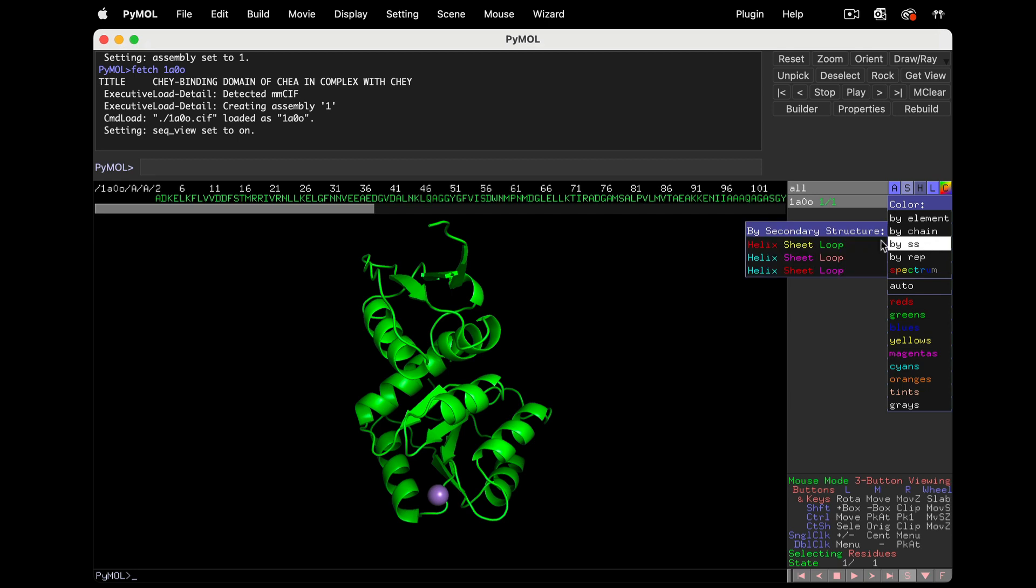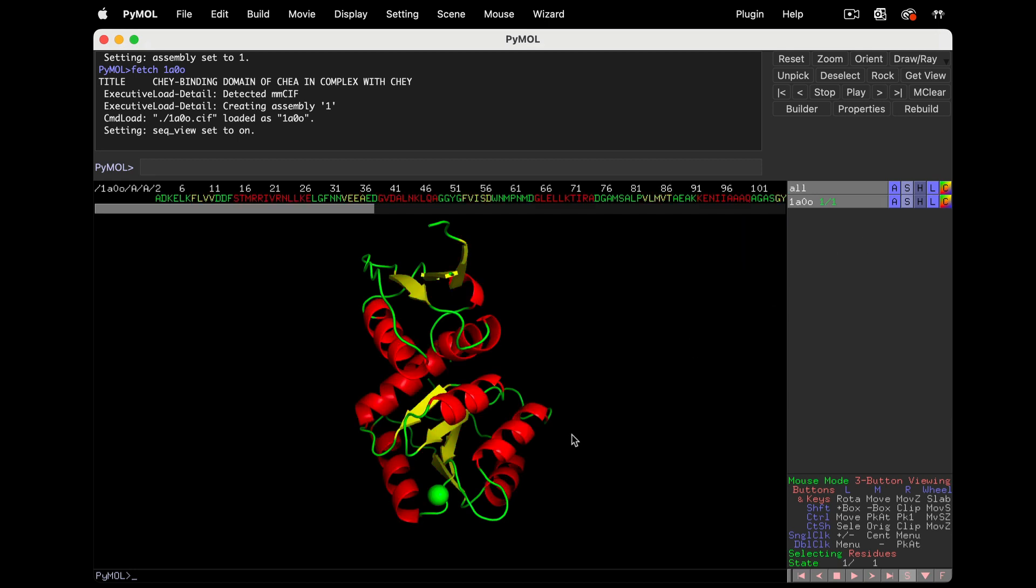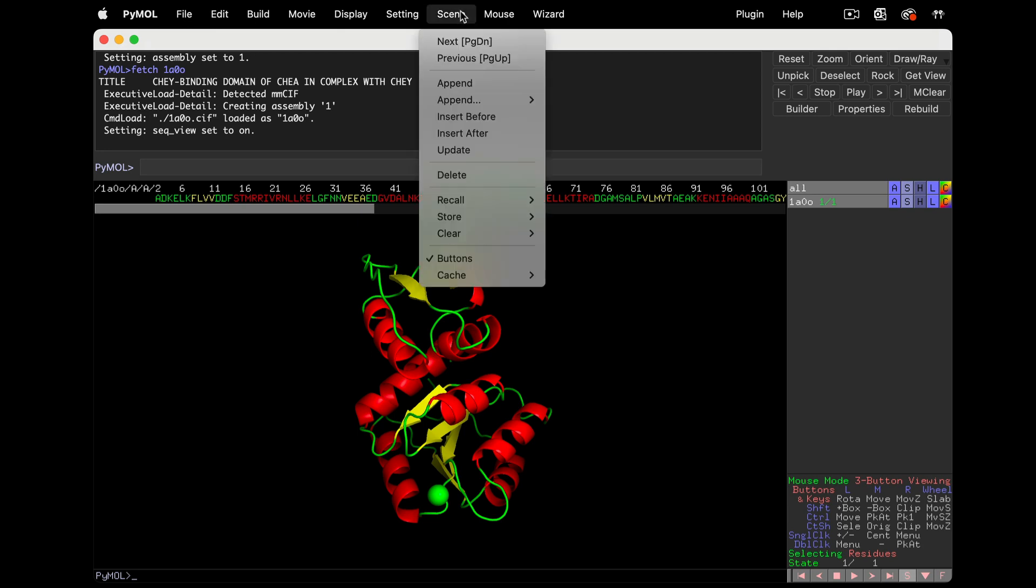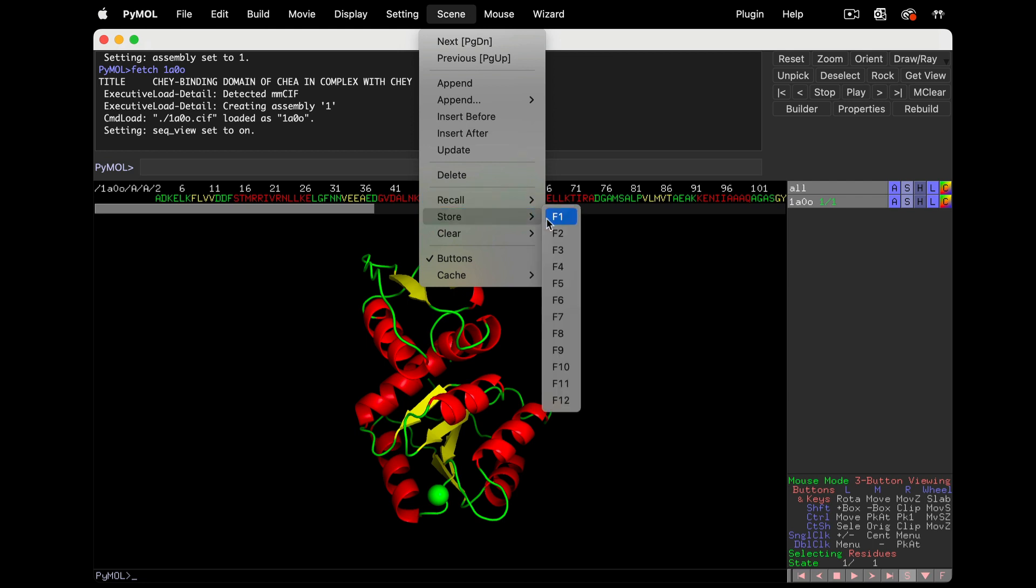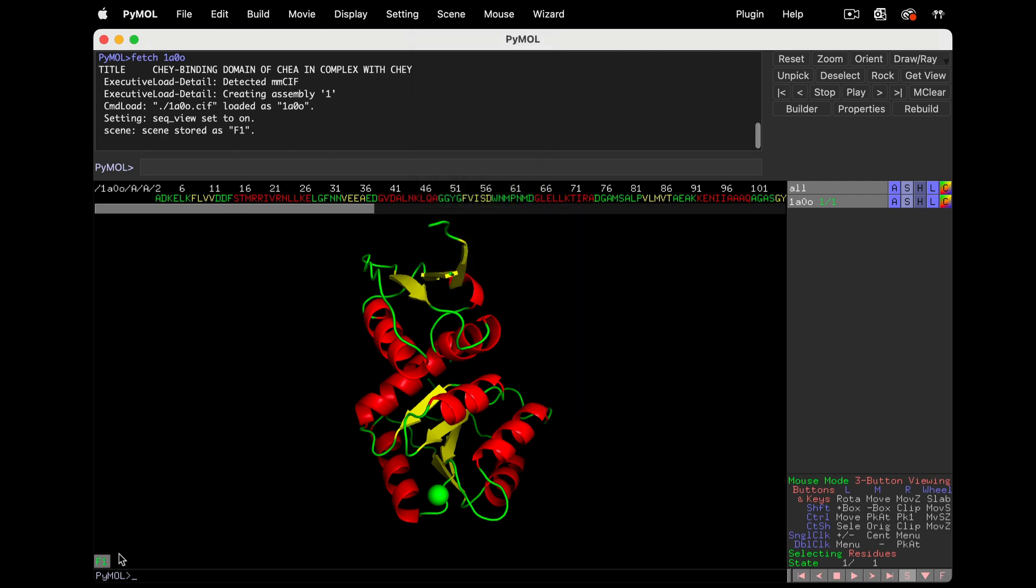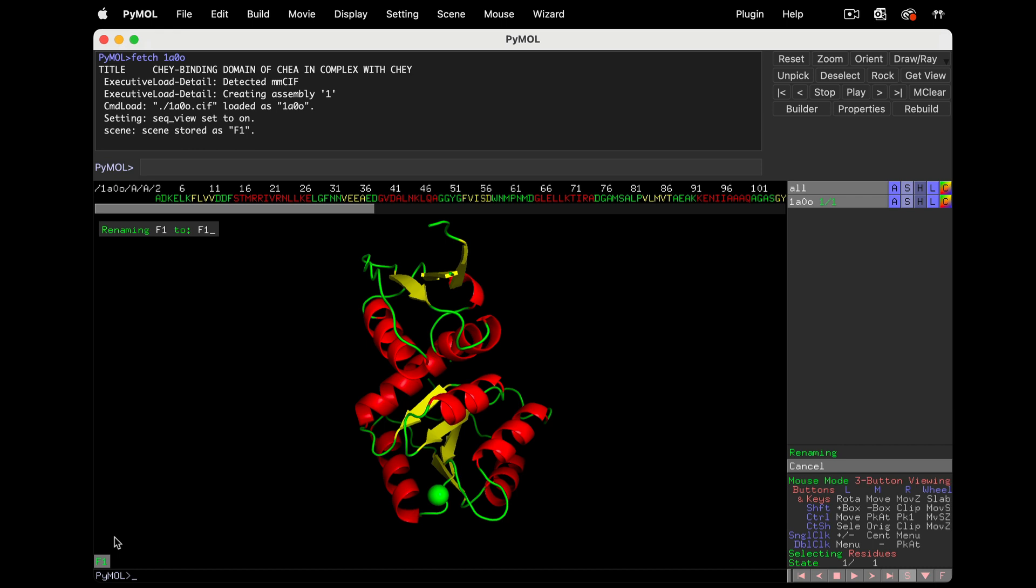Now color by secondary structure. We're going to keep coming back to this view to explore the different types of secondary structure in this model, so let's save a scene. Scene drop down menu, store, F1. Right click on F1 and rename it. I'll call it overall.